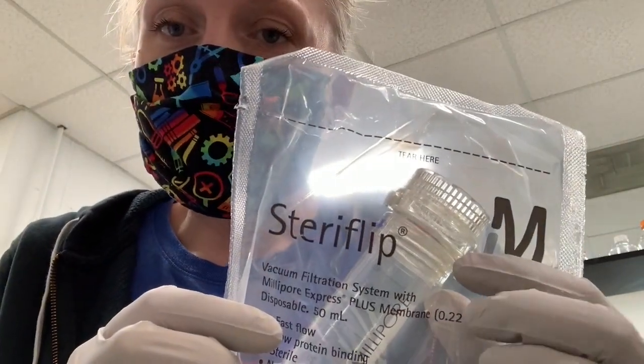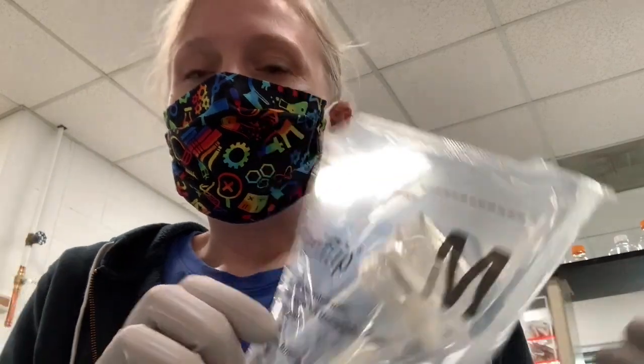And you're looking for something that has a 0.22 micron filter, and that filter has such tiny little holes that things like bacteria can't get through them. So that's one way to sterilize a solution. The other is to autoclave a solution, and I'll show you how to do that as well. But for ammonium acetate, we're going to use the sterile filtration.